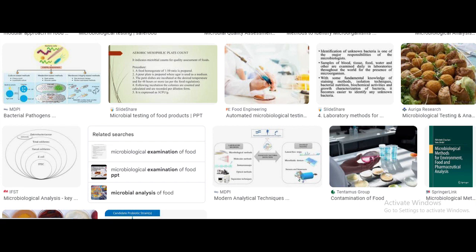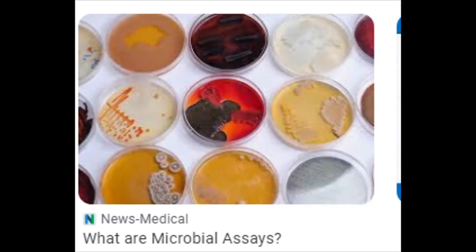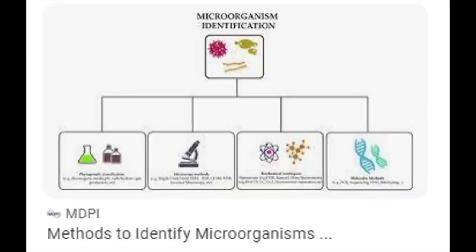But Petri dish, this is what I can find here now. I don't want to stand up and go and be bringing this thing from there. Petri dish basically means plate. When we say dish, it means plate. If you are good in your English, you will not have problems with biology at all. Petri dish means plate, Petri plate. In fact, sometimes we call it that, which is why it is called plate count. You can see, it's talking about the counting of the microorganisms on top of the plate.